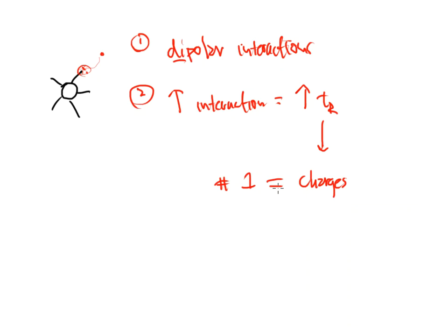So if I'm looking at the way things elute, most of the time, the positive or negative ones will come off first, and then the positive or negative twos will come off second, and then the positive or negative threes will come off third. Now, it doesn't happen this way every single time.